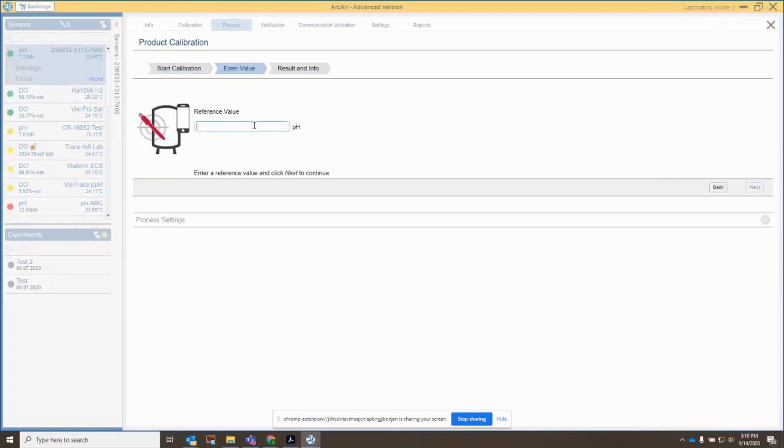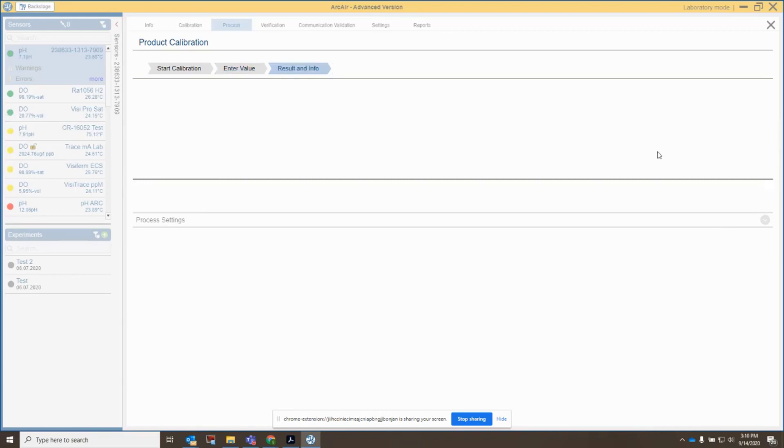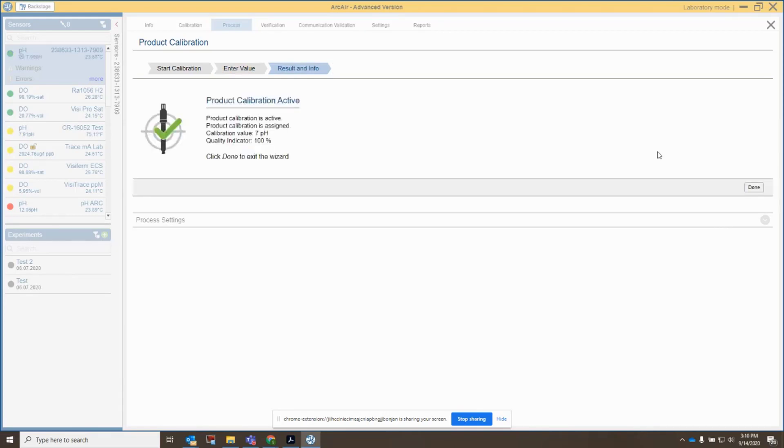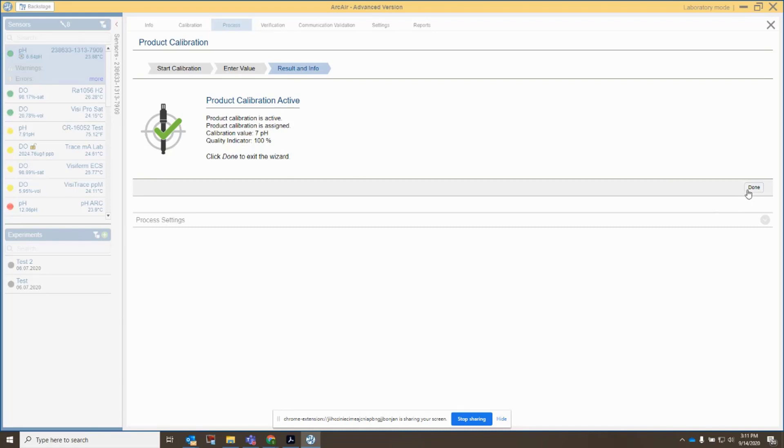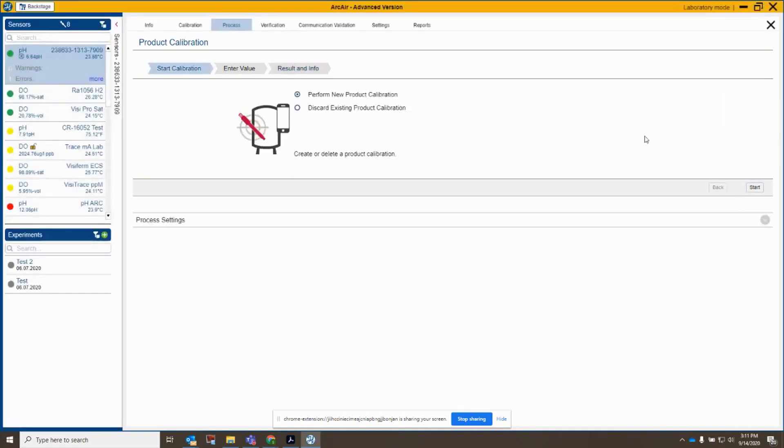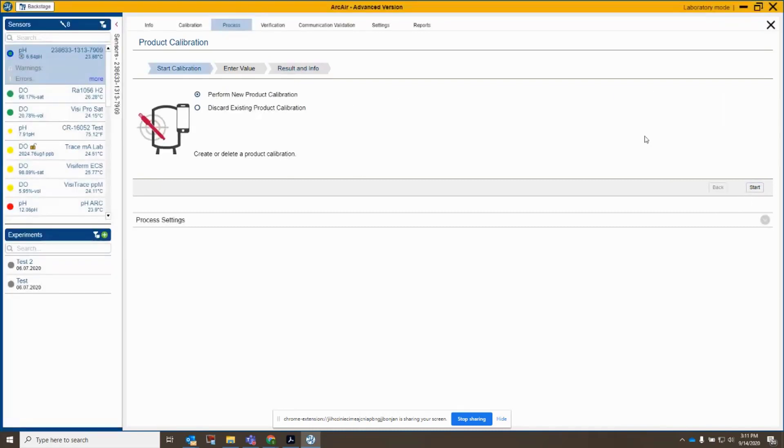And in this case, it's going to ask me what my reference value is for my pH. So I'm going to say 7.00 because that's what I'm in. I'm in 7 buffer, and I'll click next, and it's almost there. And it's overshot a little bit here. It's at 6.64. I'm going to say done.